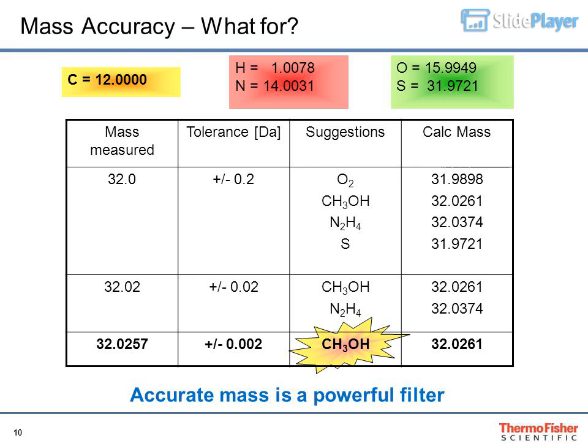N equals 14.0031. O equals 15.9949. S equals 31.9721. C equals 12.0000.